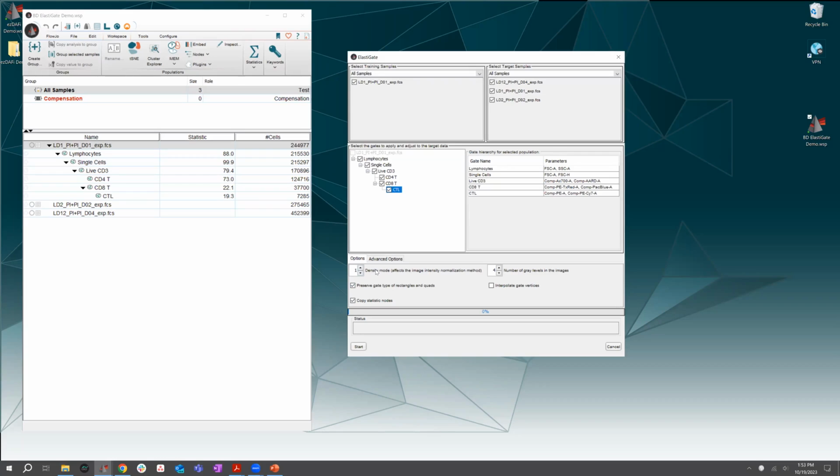But if you want to pay more attention to sparse areas, like more outliers, then you would turn that number down. You can start with 1 and always run different iterations of the tool and see what works for you. But if you feel like your populations are very major and you want to ignore the more sparse ones, you can maybe just turn that up a bit.